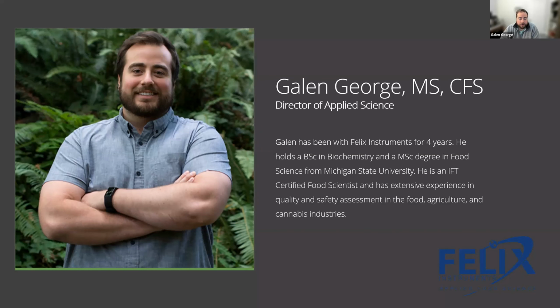The next stage is going to be the model deployment. And before we even deploy a model, we also need to validate. So that's what we'll be talking about next in this process. But just a little bit of a review on what we talked about last time. This is important for today because, as much as what we talk about today does matter and has an impact on the quality of the models you build, the most important part, and I think many people would agree with this, is the sampling and the testing and the collection of the spectra. Because the saying is garbage in, garbage out.